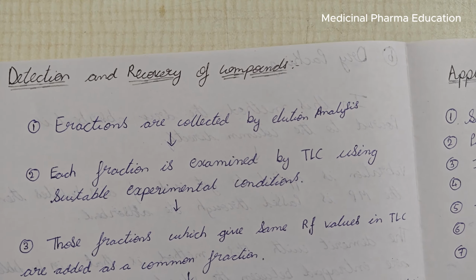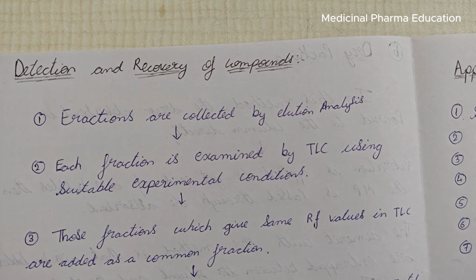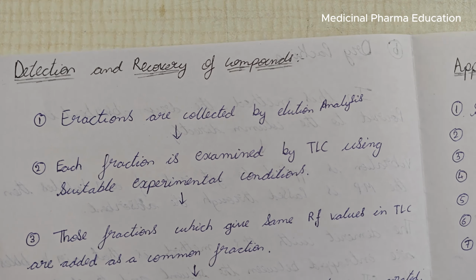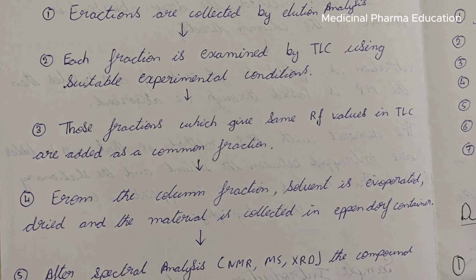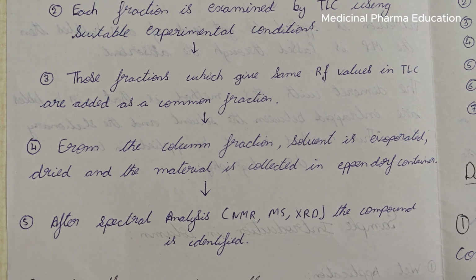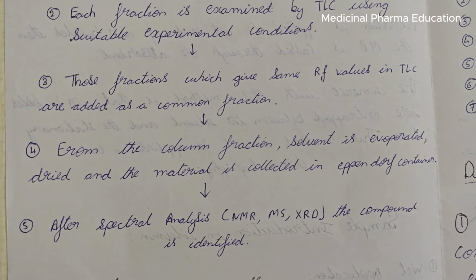Next, detection and recovery, it's simple. Just read it out. We'll collect the fractions and analyze them using different techniques. You just pause the video and read it out, because the video becomes longer.